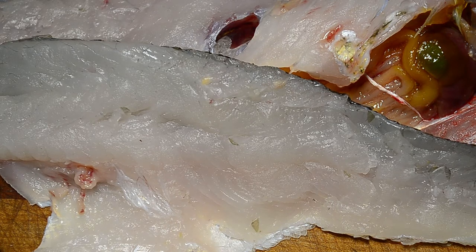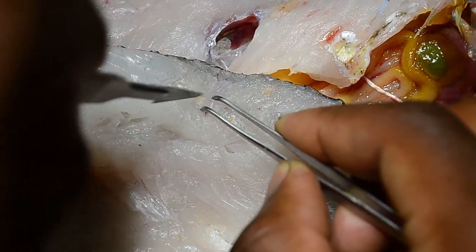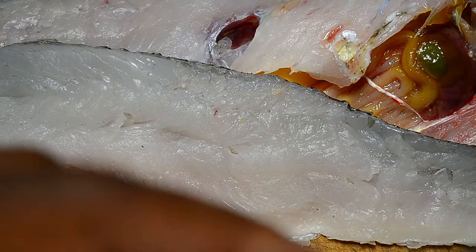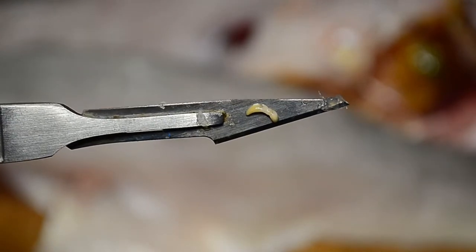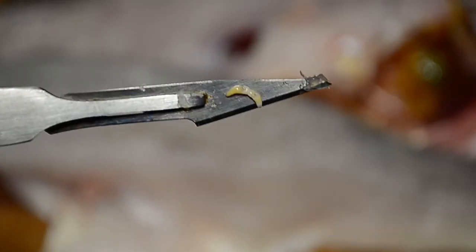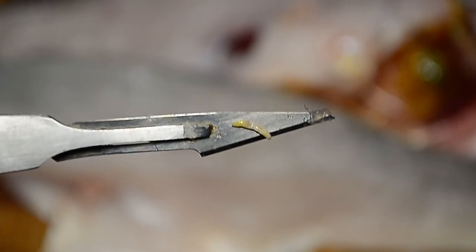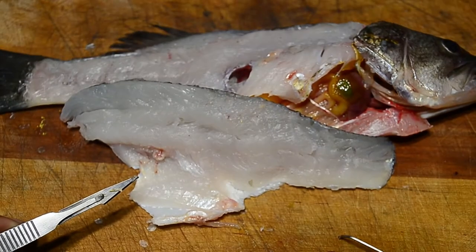Let's see if I can extract one more smoothly. There it is — I think I may have killed it when I took it out, but it is still moving so it's not completely dead. Those are the worms people warn you about in fish. That's why you need to cook your fish completely and thoroughly. This was wild-caught, so you definitely need to cook it correctly.